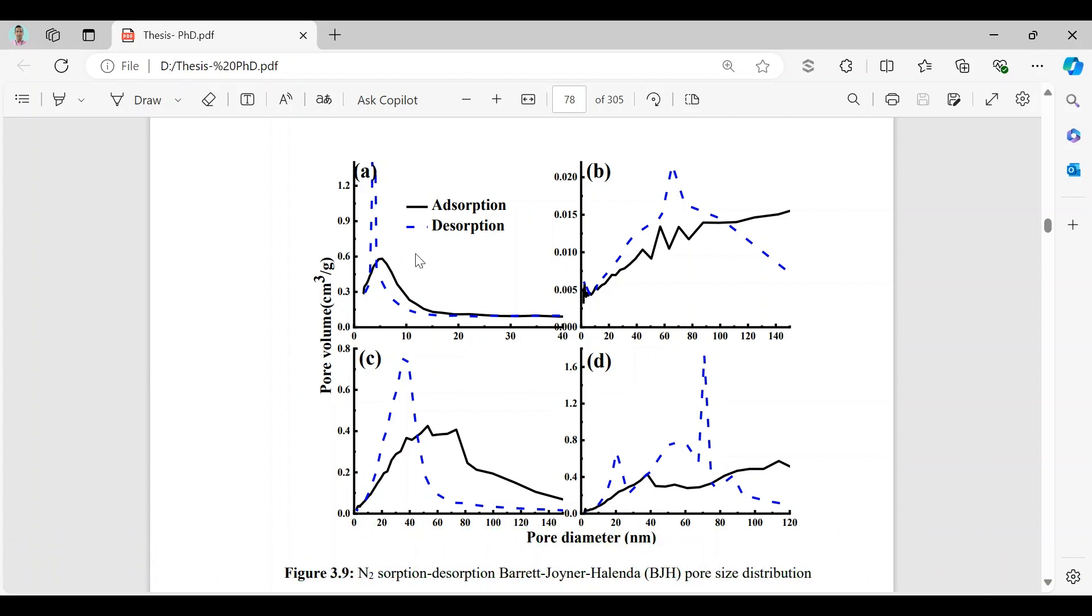Now let us consider case B which is pyrocite. If we consider adsorption pore size distribution curve we see that there are four peaks: 1, 2, 3, 4. Four peaks observed for adsorption distribution curve and one peak observed for desorption distribution curve.